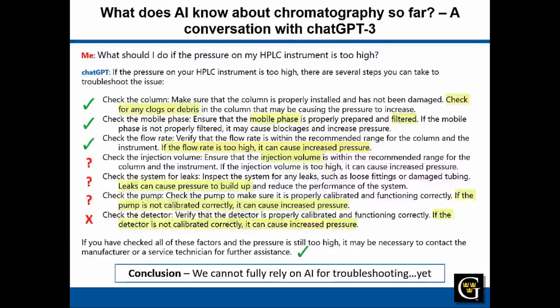But it does finish on a strong note saying that if you've checked all of these possibilities, it may be necessary to contact the manufacturer or a service technician for further assistance. Certainly, this is good advice. So I think the conclusion here from this little experiment is that we cannot fully rely on AI for troubleshooting, at least not yet.